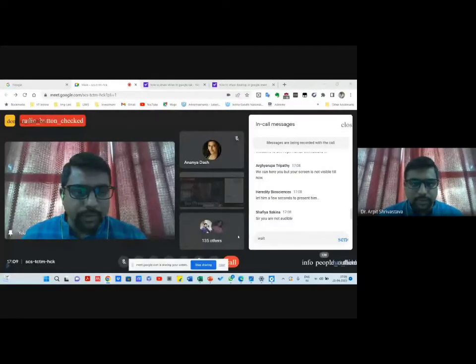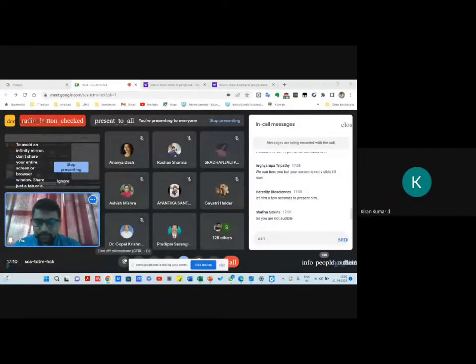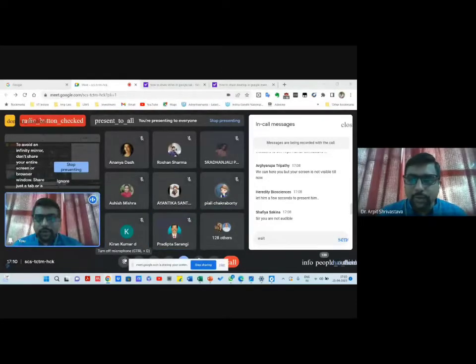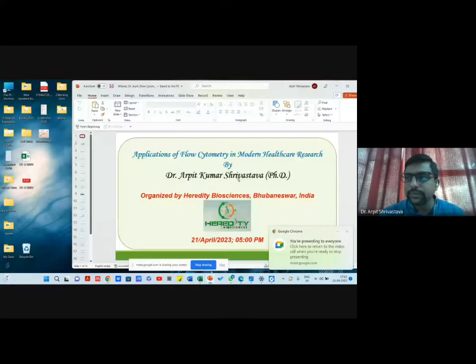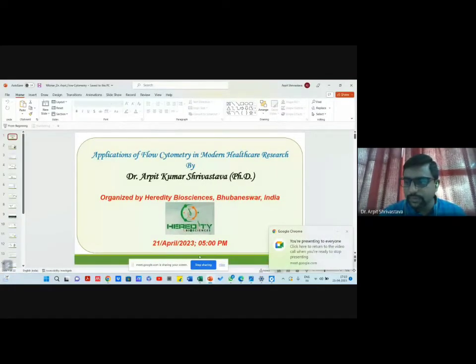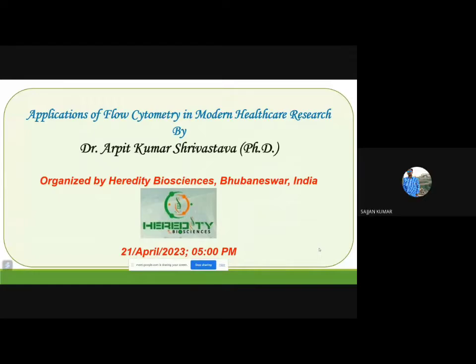Now am I visible? Yes, sir. Okay, so once again, I would like to thank Dr. Gopal for providing this nice introduction. And today we will start with flow cytometry. I'll just quickly go to the slides. Is everyone able to see the slides? Yes, sir.